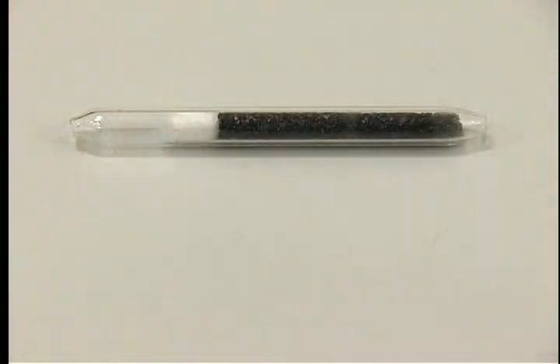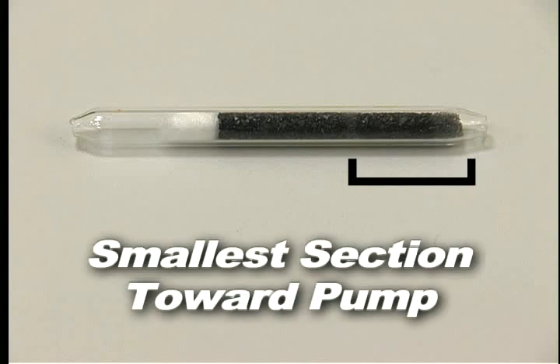If the tube does not have an arrow, then place the end of the sorbent tube with the smallest sorbent section, backup section, into the tube holder toward the pump.